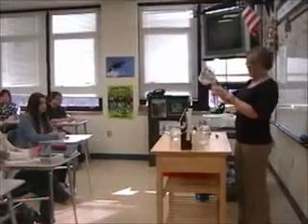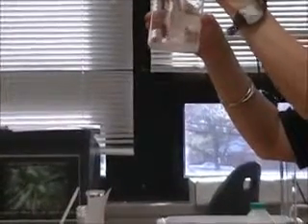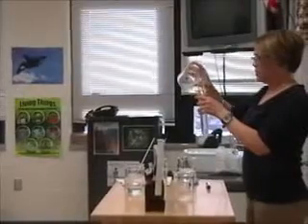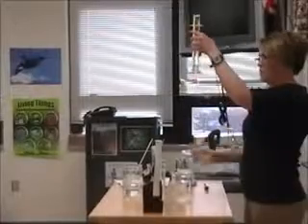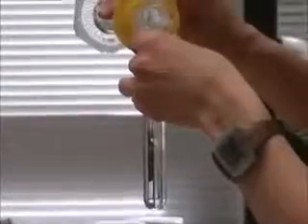So let's put in a little bit of our B. Once again, the B solution is the same every time, and it's got the starch in it. I'm just putting in the same amount every time. Why do I have to make sure the B solution is the same every time? You can only test one variable. Yeah, very good. You can only test one variable at a time. So we're testing our A variable. For right now, we're testing the temperature. Okay? All right, so this is cold, so here we go. Ready? Got your fingers on the button? And start.